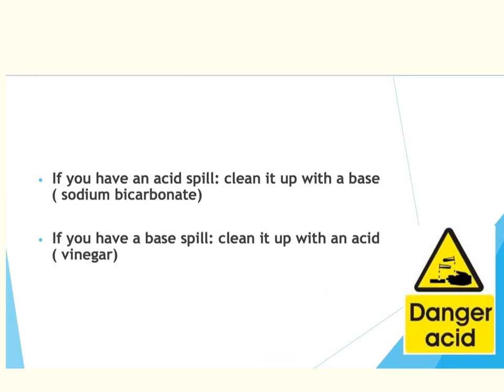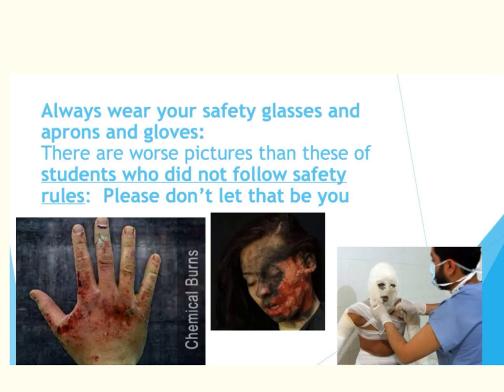If you ever have an acid spill, we will clean that up with a base — a sodium bicarbonate wash, which is basically baking soda powder mixed with water. If we have a base spill, we will clean that up with an acid. I will be using vinegar as a three percent acetic acid to help neutralize the base. Both of these will be available on lab days where acids and bases are present. I cannot emphasize enough how important it is for you to wear your safety glasses, your aprons, and your gloves. We do have various gloves needed, whether heat resistant or chemical gloves, per lab setup.